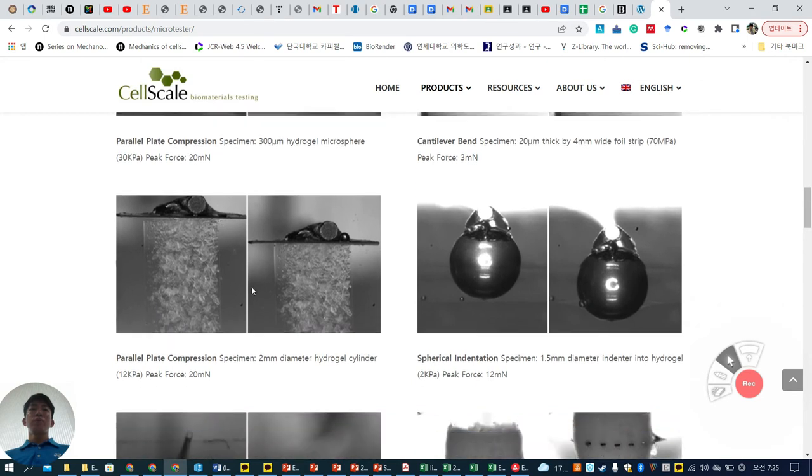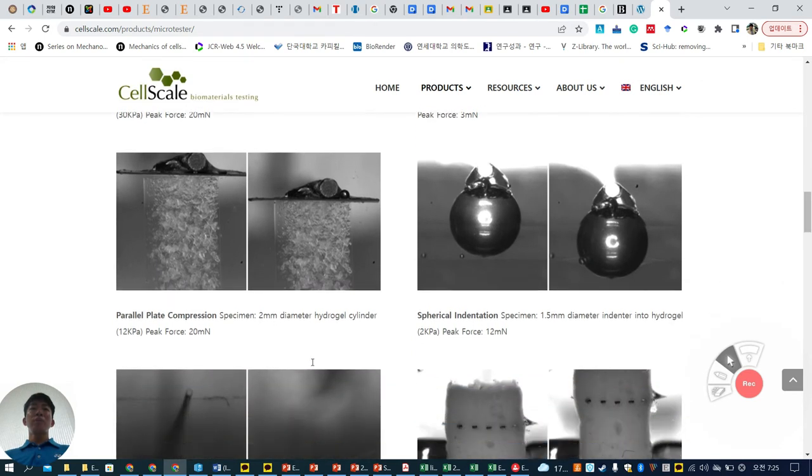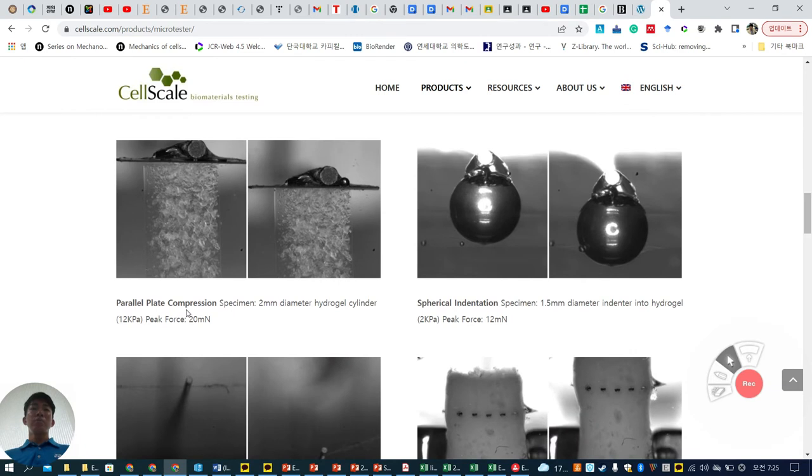So this is 2 millimeter hydrogel. So you can measure like that. Peak 20.